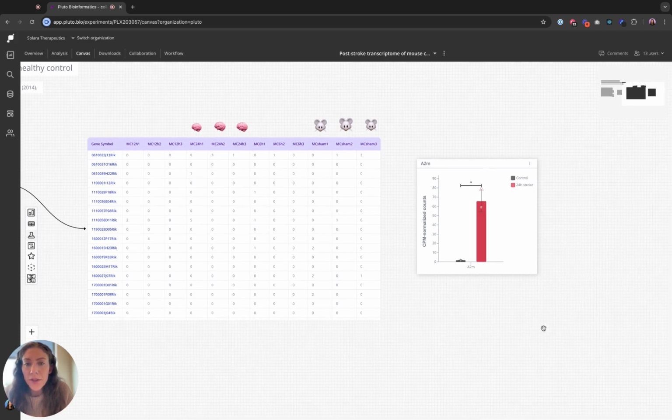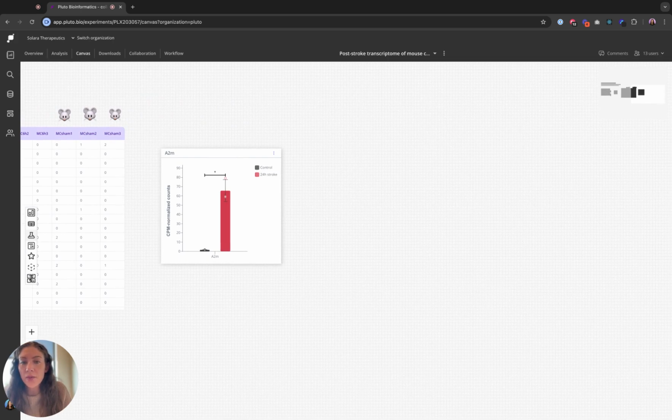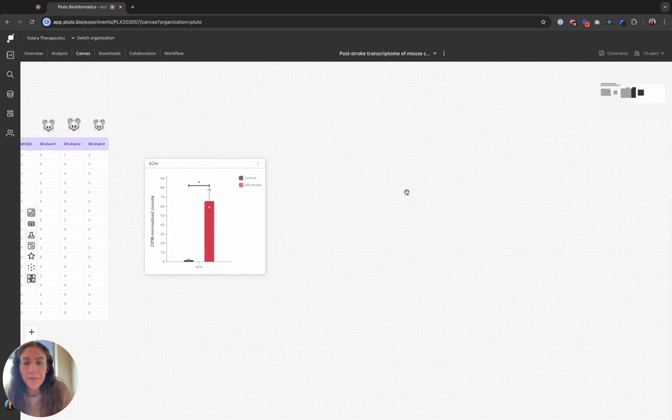And that's really where differential expression comes into play. We want to be able to do this kind of comparison, but for all of the genes that were measured in our assay, and then use the correct statistics to adjust for the fact that we're doing this kind of comparison 30,000 plus times.